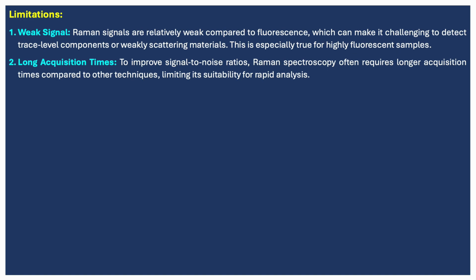Besides that, it has a number of limitations. Raman signals are relatively weak compared to fluorescence, which can make it challenging to detect trace level components or weakly scattering materials. This is especially true for highly fluorescent samples.